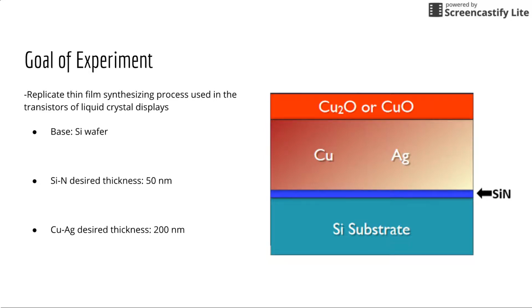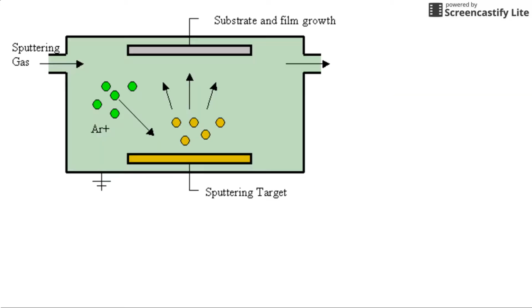Silver by itself is corrosive and has issues with agglomeration. The encapsulation layer of copper oxides used was a preventative measure. Aluminum copper was used in industry before, but now silver is preferred due to its low bulk resistivity of 1.47 microohm centimeters for higher current density and switching speeds. This is imperative to achieve clearer and brighter screen displays.